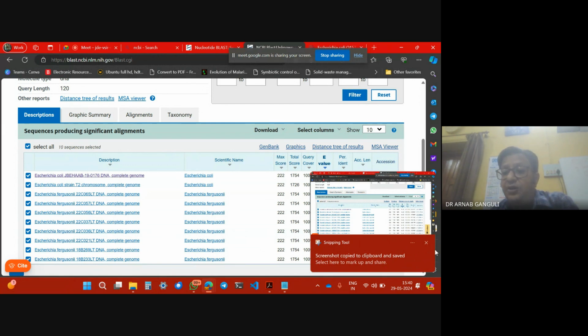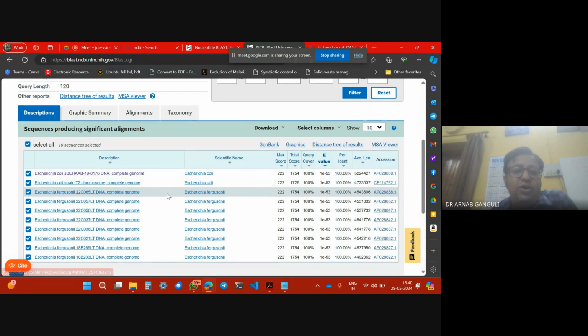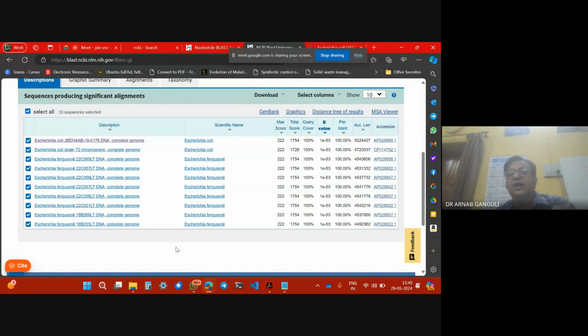This is absolutely very interesting. Currently, my focus in my personal research, I do a lot of bioinformatics. Of course, I need to do these BLASTs, even though it may seem very basic, but still you need to do these things. Next, in the next class, I will be talking about how you make phylogenetic trees, how you use Clustal, and how you make phylogenetic trees.